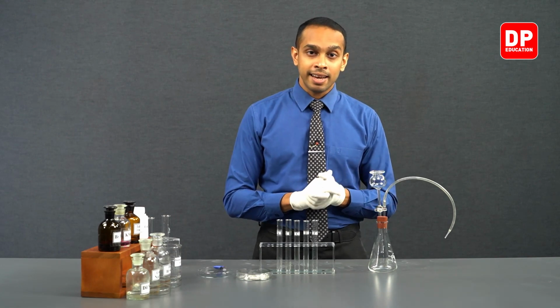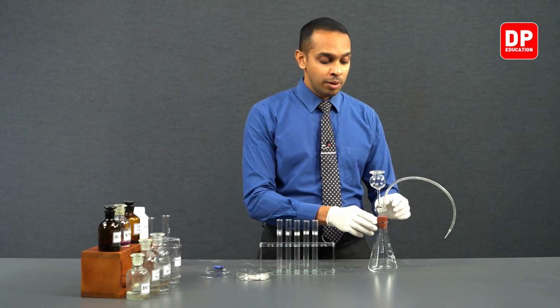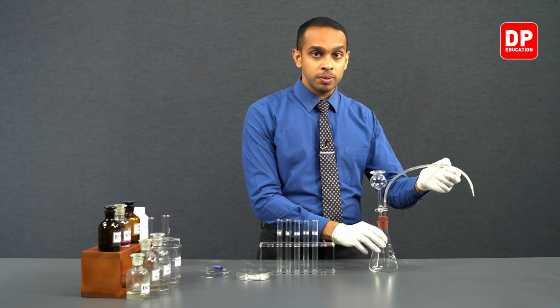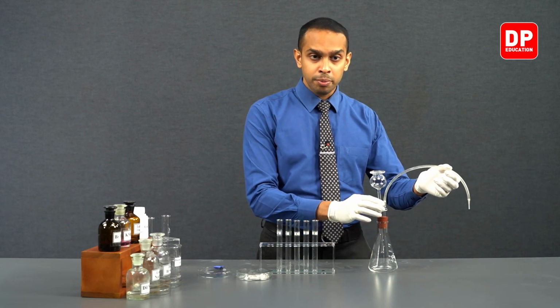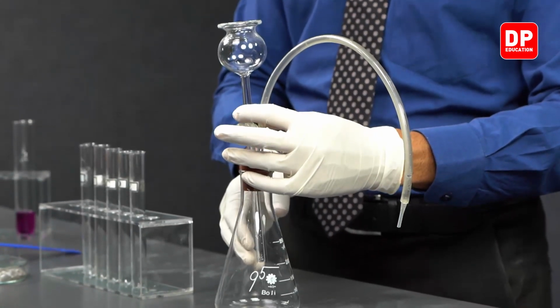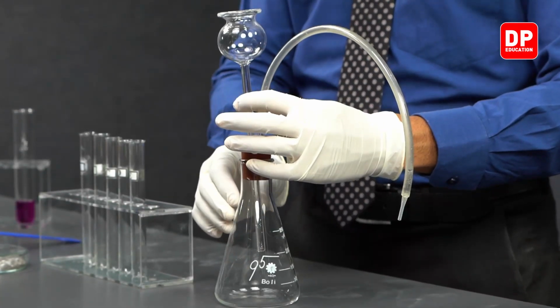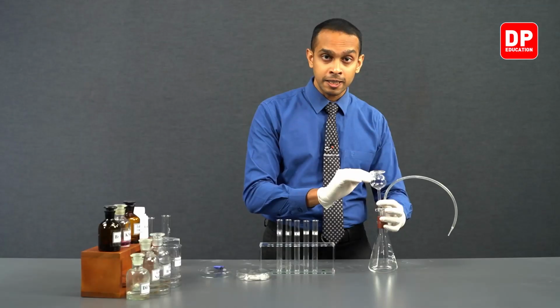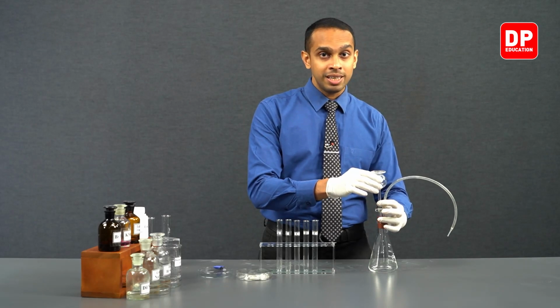So this gas that is produced can be taken out of this container with the help of a delivery tube. Now, another benefit to having a thistle funnel is that the gas that is produced will not be going out of the thistle funnel, because the thistle funnel will be containing a liquid inside.